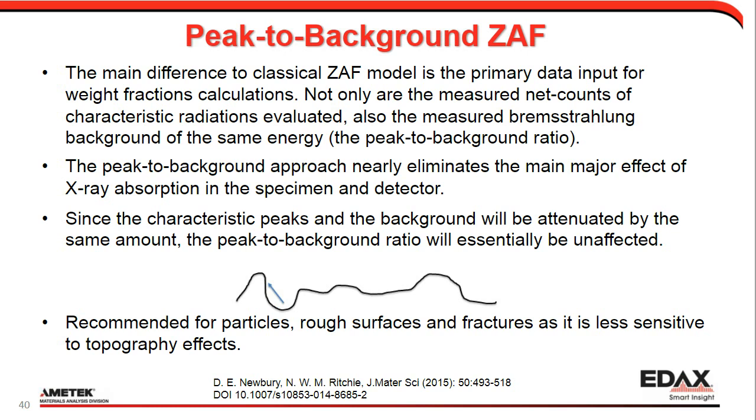So the peak-to-background approach nearly eliminates many of the major effects of X-ray absorption in specimen and detector. That means this model is recommended for particles, rough surfaces, and fractures, as it is less sensitive to topography effects.